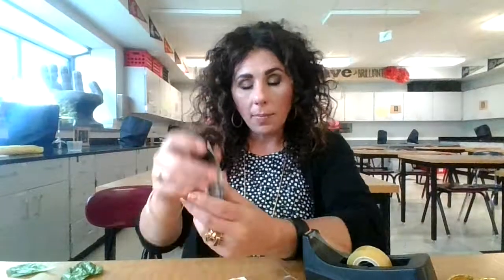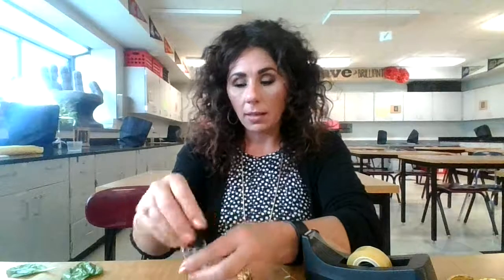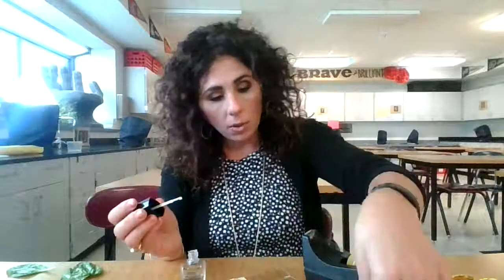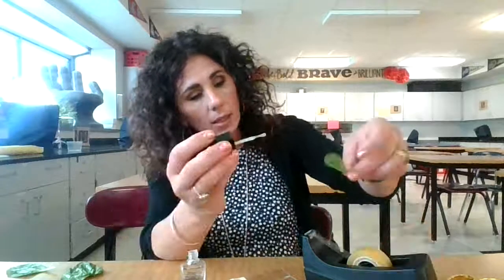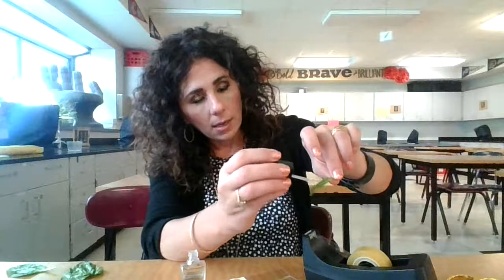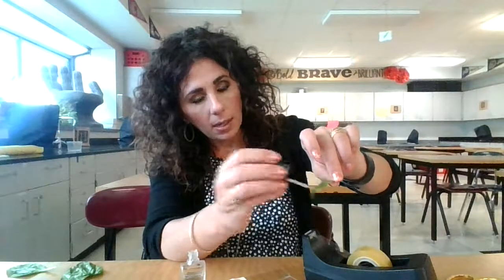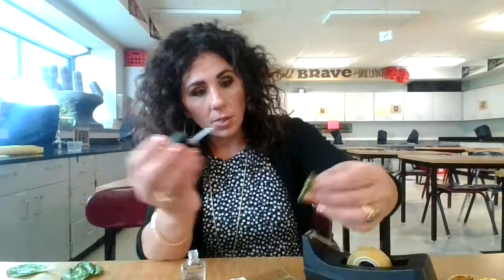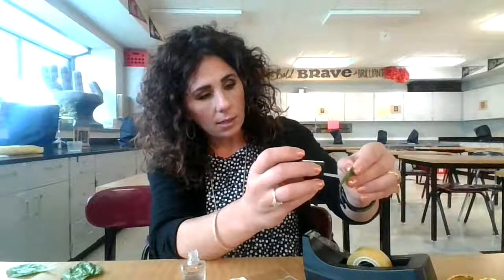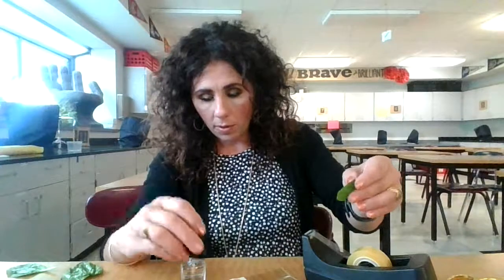I would take clear nail polish and paint a thin layer onto the upper side of the leaf, and paint a thin layer on the underside of a different one, because we're going to pull both of those off and compare them.